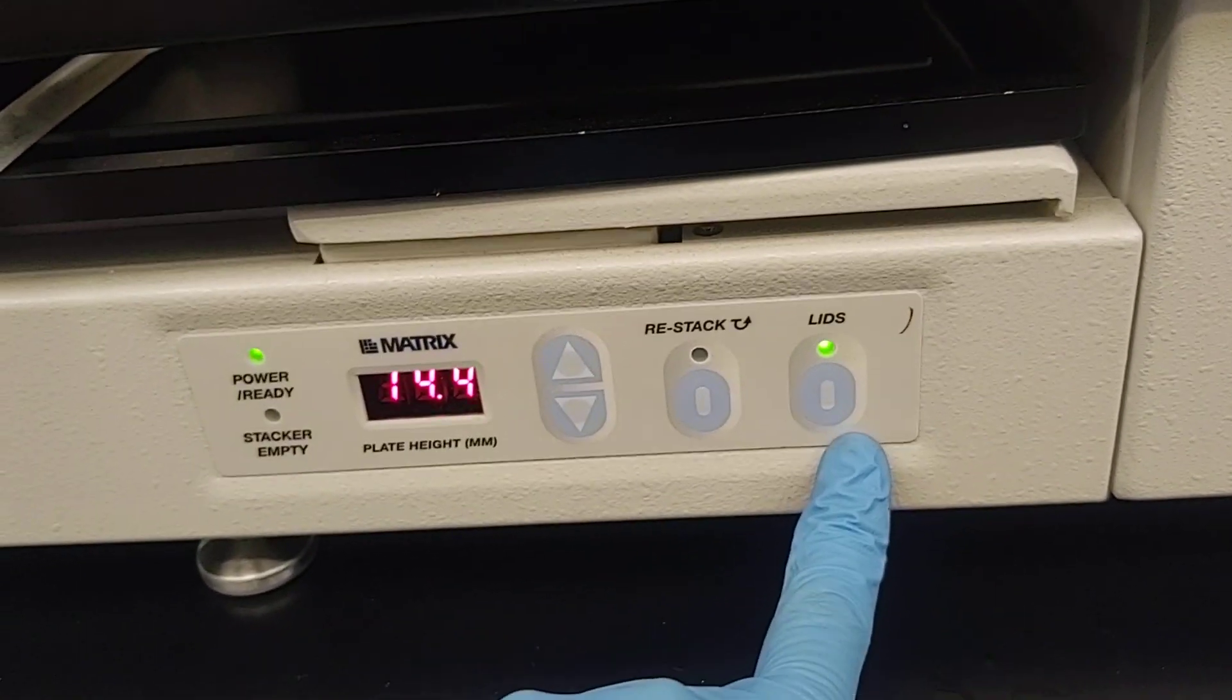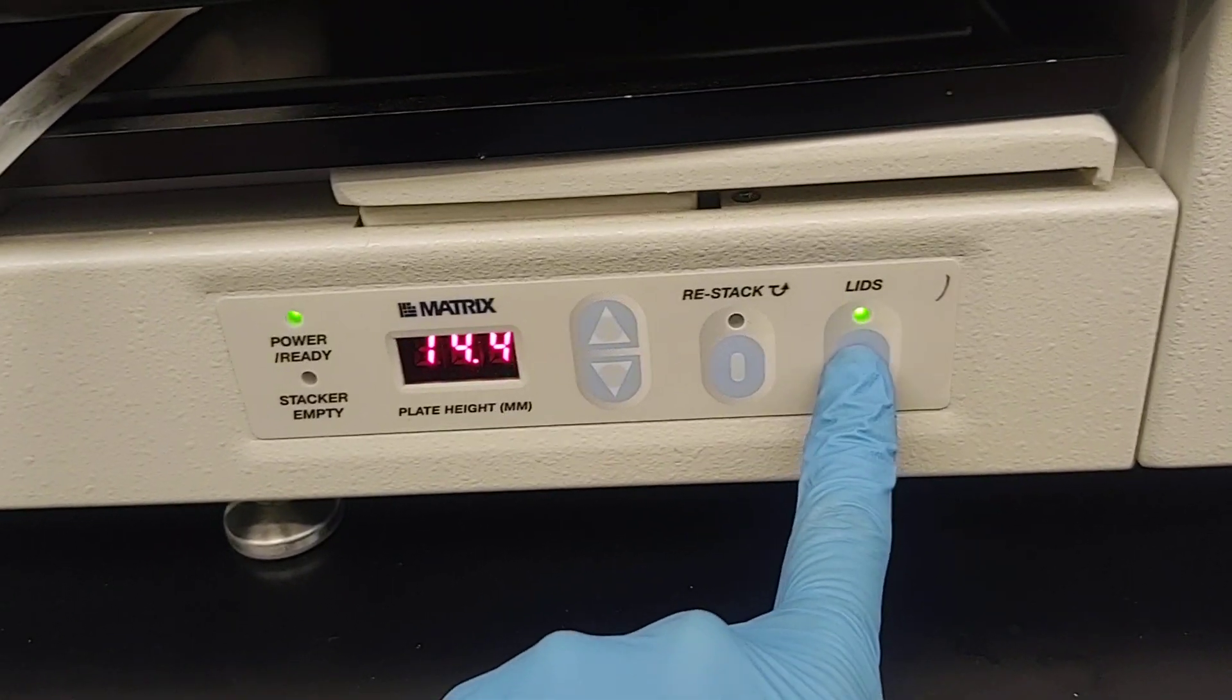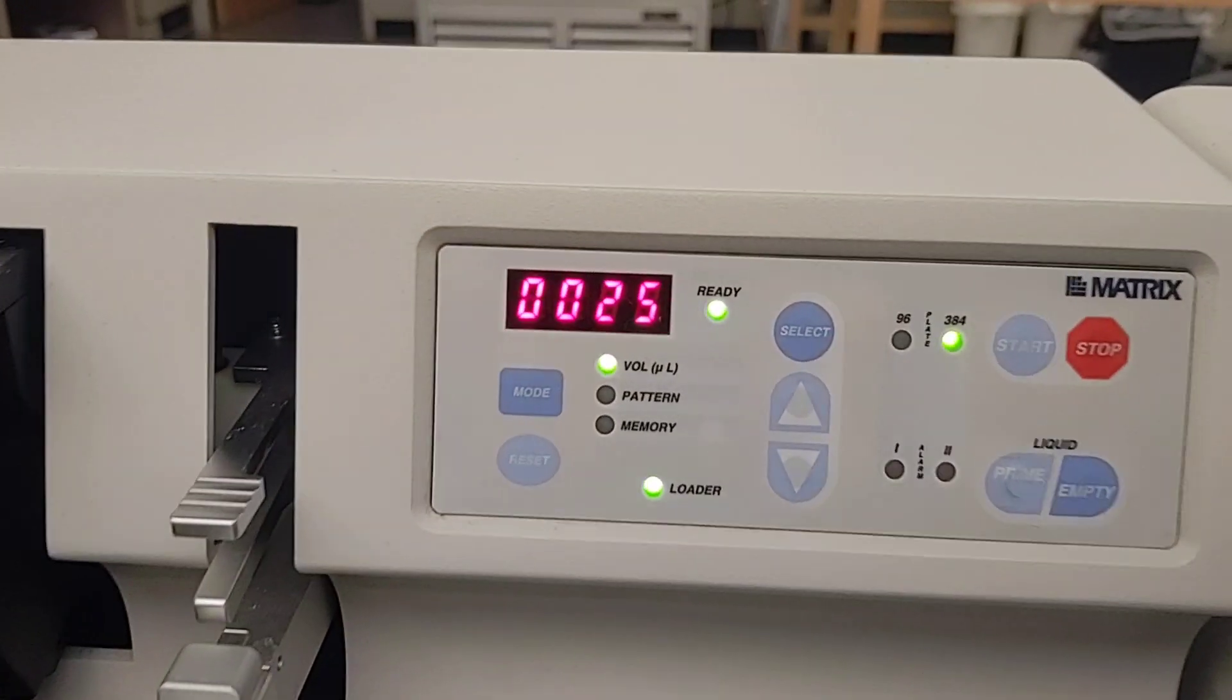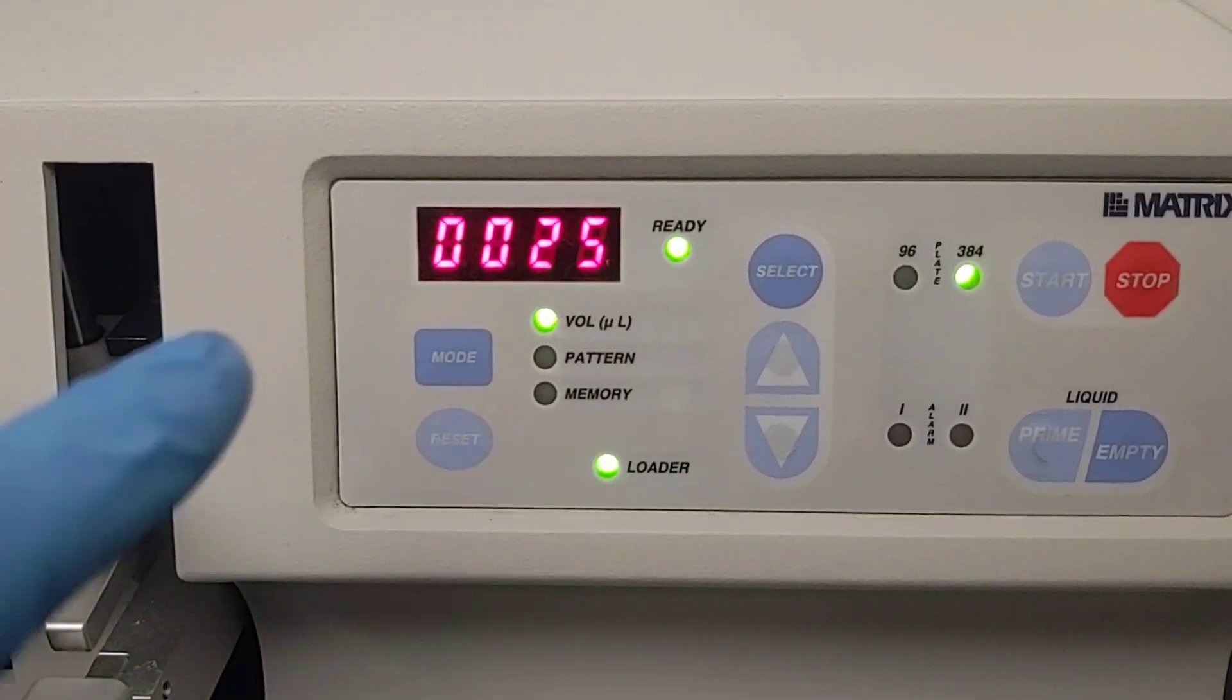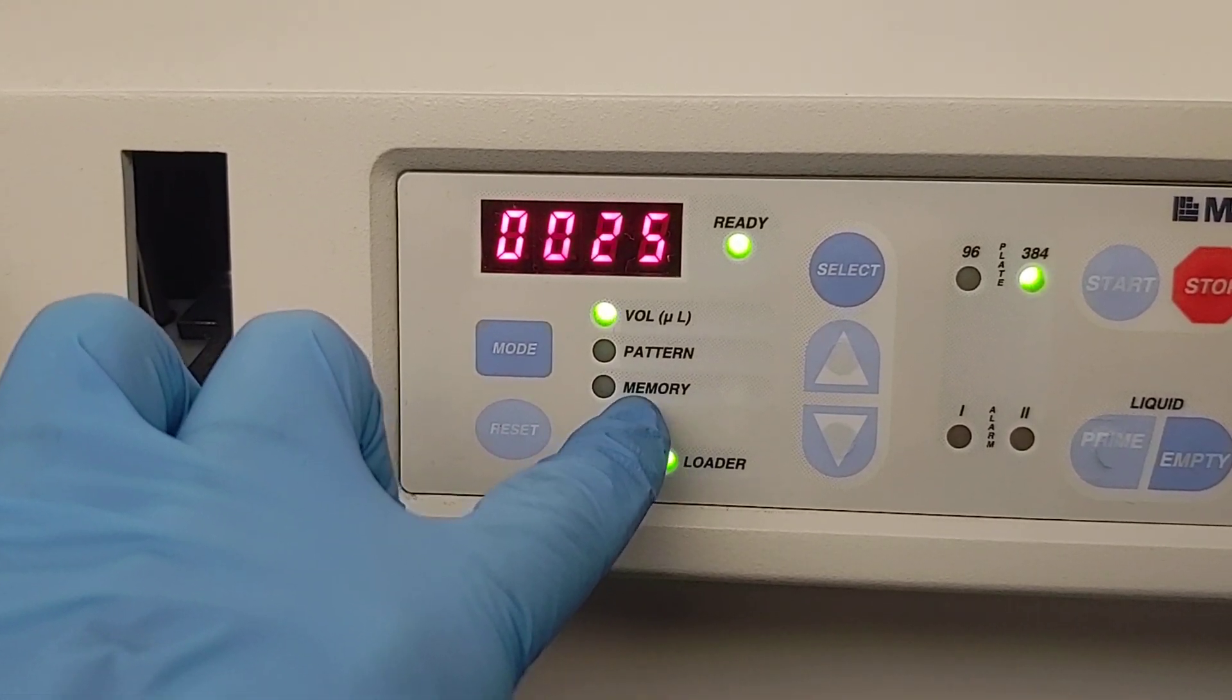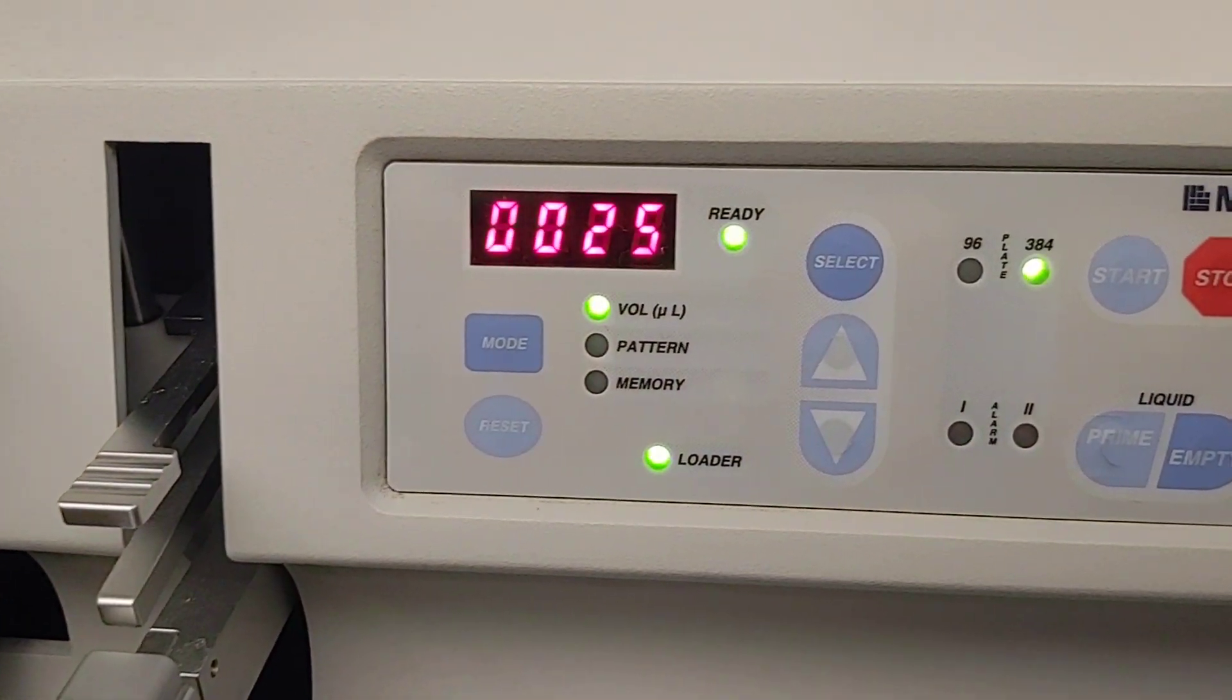If you want to load plates with lids on and have it automatically remove the lids and put them back on for you, then you can toggle that on. And then over here is where you can either load a program from the memory or just set a certain volume, in this case 25 microliters.